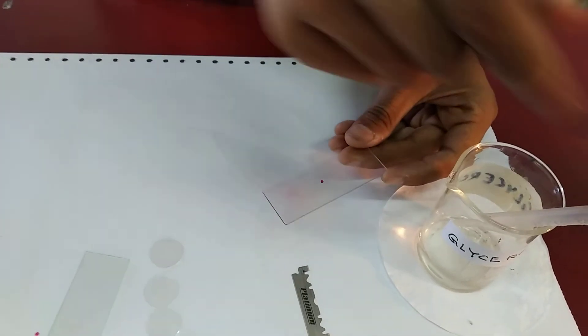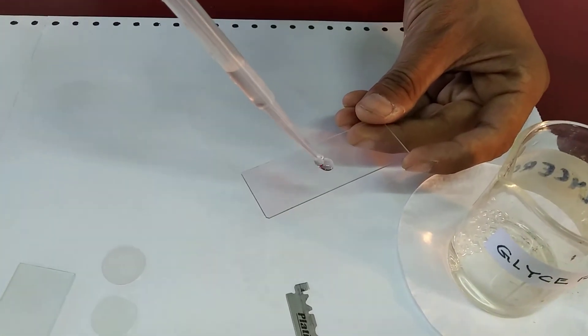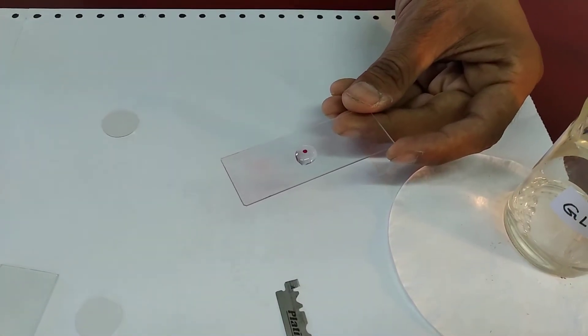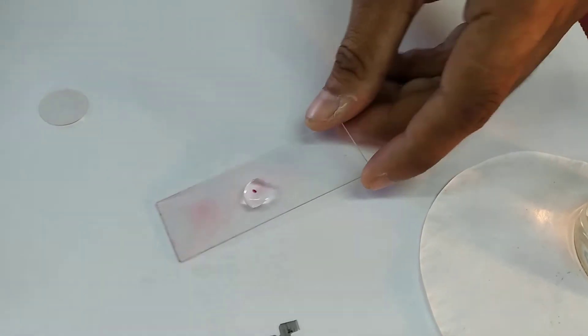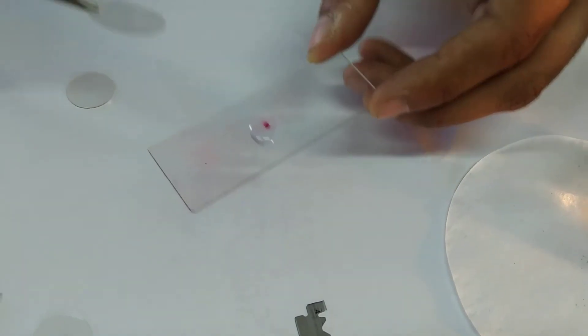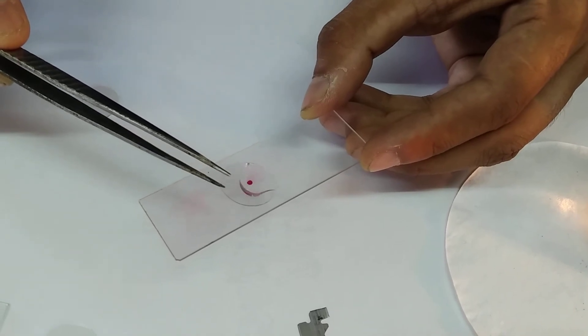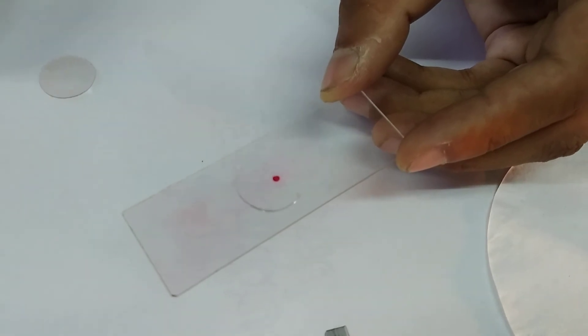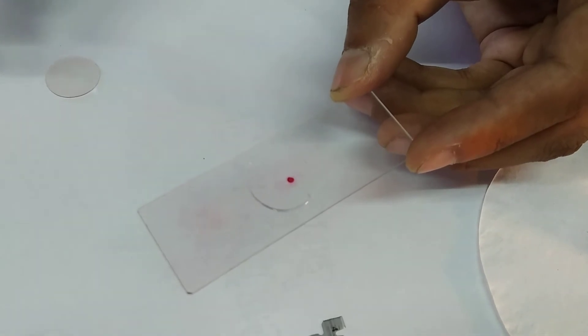Now the most important part of the experiment. Add a drop of glycerin on the section and slowly cover it with a cover slip. When placing the cover slip, be very careful so no air bubbles enter. You don't need to press or anything. Just let the cover slip rest on the section. You can see there are no air bubbles.